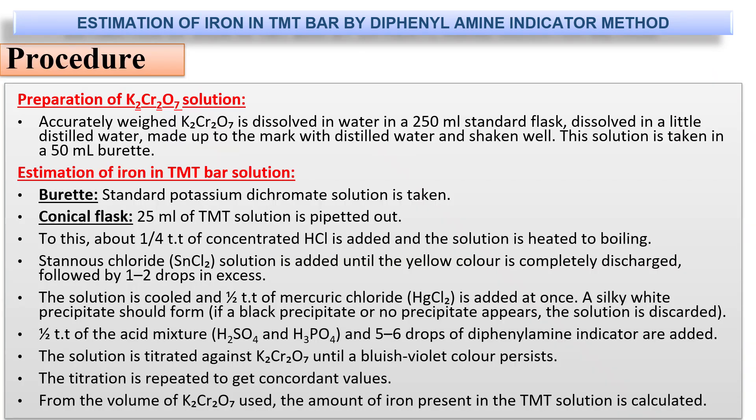Let us look at the procedure. Initially, we prepare the potassium dichromate solution. Accurately weighed potassium dichromate is dissolved in a 50 ml standard flask with a little distilled water, shaken well, made up to the mark, and filled into a 50 ml burette as the standard potassium dichromate solution.